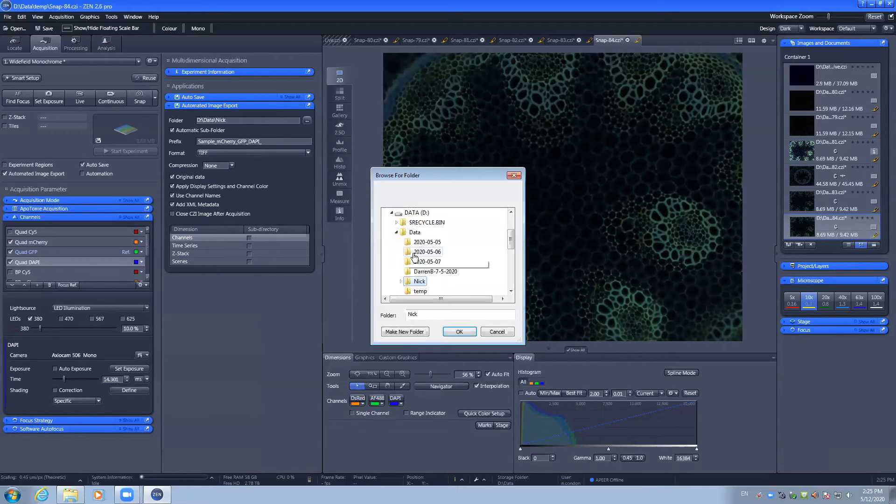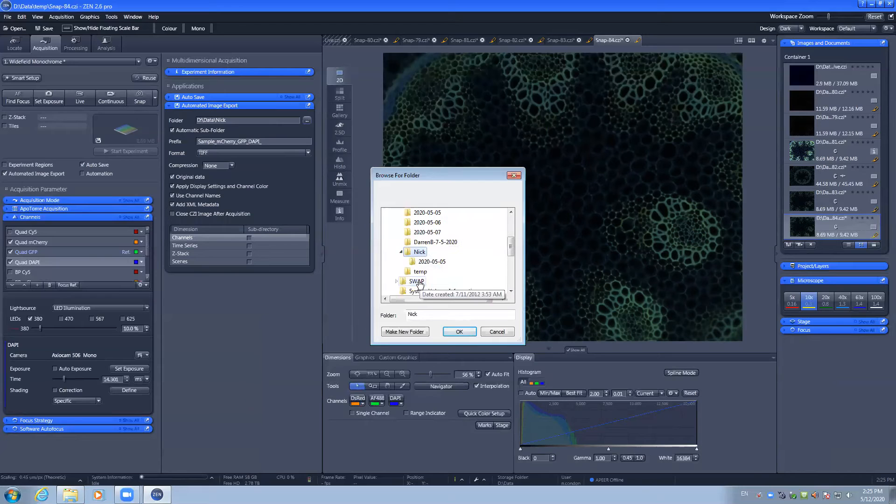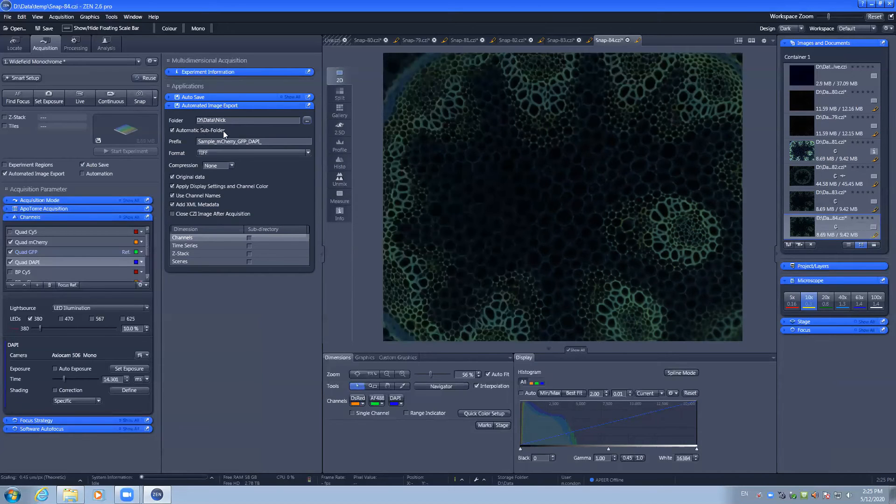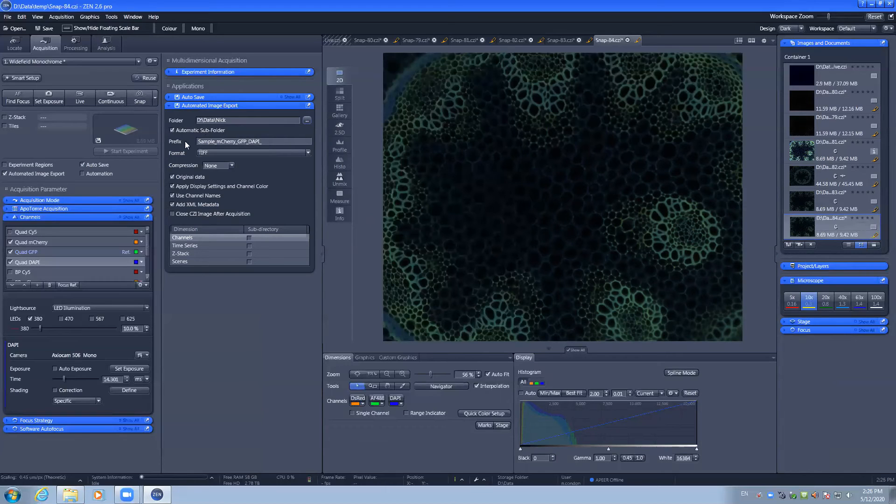You can navigate to your working folder by the file path, add in a prefix that is relevant to these samples, and choose the output format.